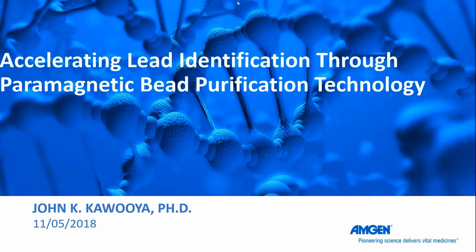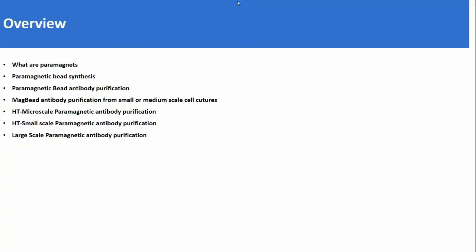Okay, I'm going to present Accelerating Lead Identification Through Paramagnetic Bead Purification Technology, as shown in the title here. The overview of this presentation is as follows, as you can read down here. What are paramagnetic beads? How are they synthesized? And how are they applied in the magnetic bead purification of antibodies?